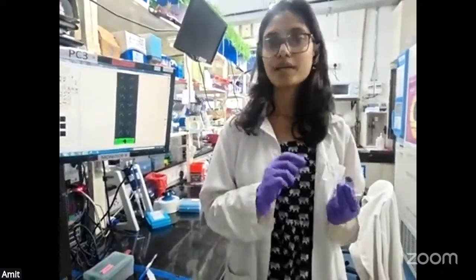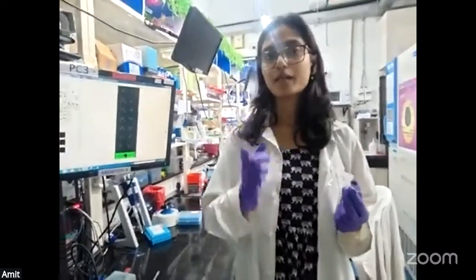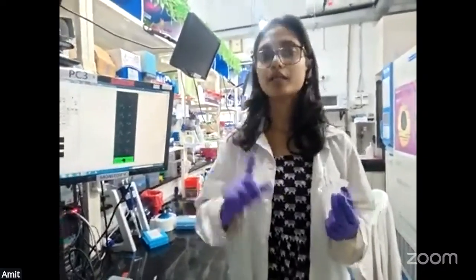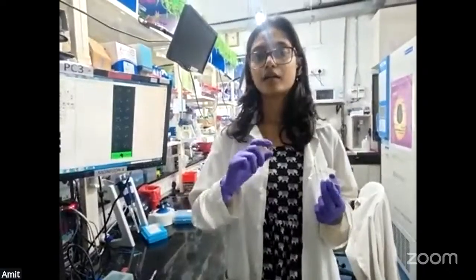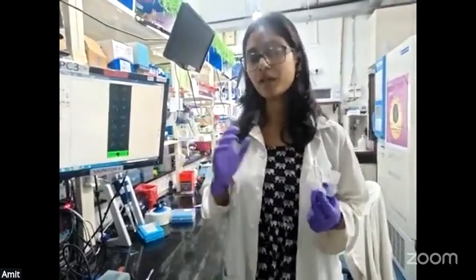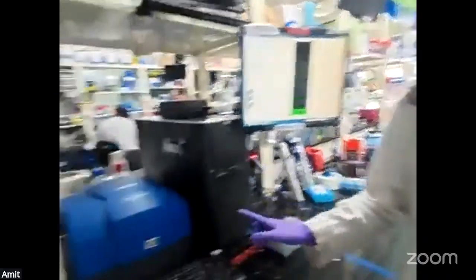It will bind to these antigens at a particular epitope, and that is how the incubation of primary antibody with the antigen happens. Now we'll incubate with secondary antibodies. The point to be noted here is that the secondary antibodies are fluorescently linked. So these secondary antibodies will bind to these primary antibodies, and they will release a signal in the form of fluorescence. That fluorescence is what we need to detect, and that intensity is what we need for data analysis.